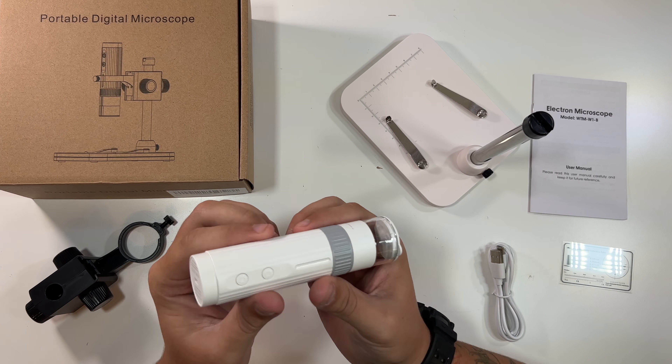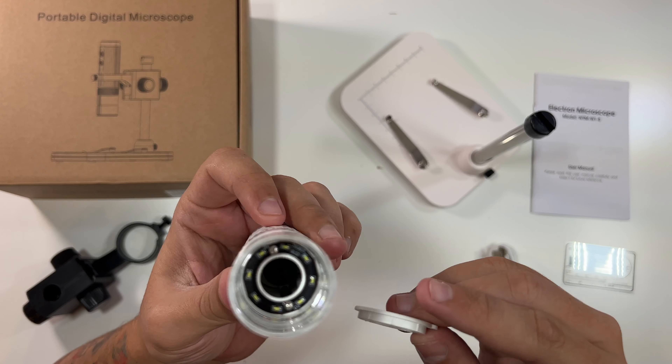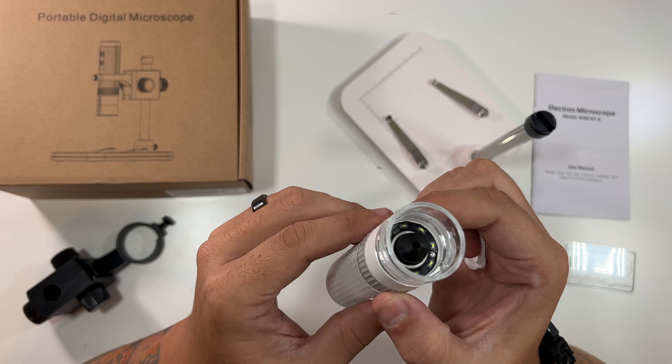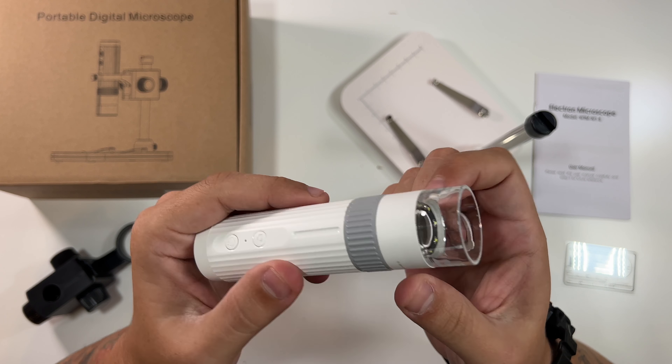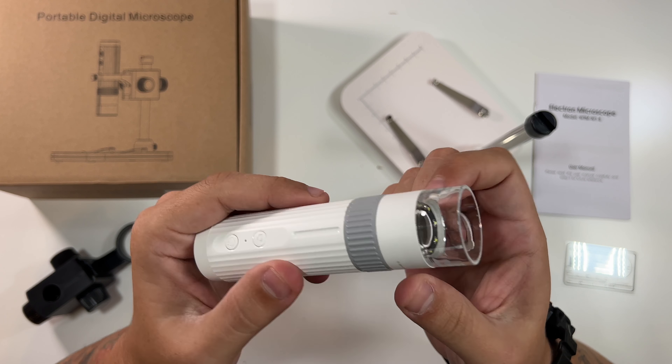This is the pole that goes down here and screws into place — look at that, we're halfway there. And this is the actual microscope. You can see a little USB-C port on top, a button for the lights, and the microscope lens down there. It extends all the way out, which is amazing. There's also a power button, a camera button, a light button, and a dial to zoom in and out.